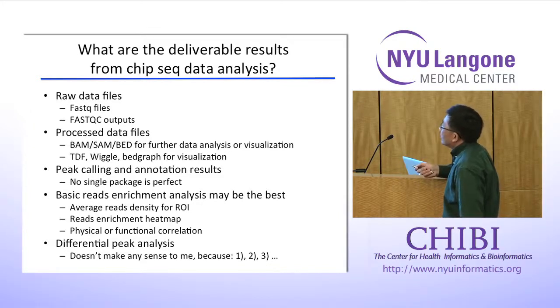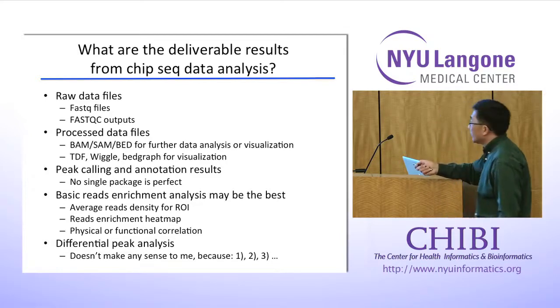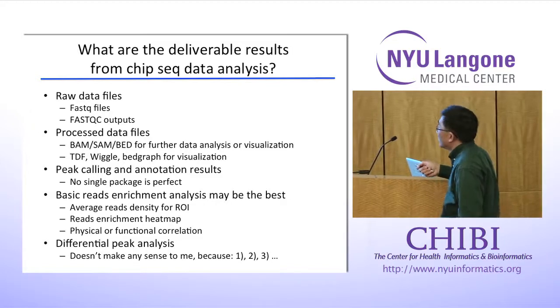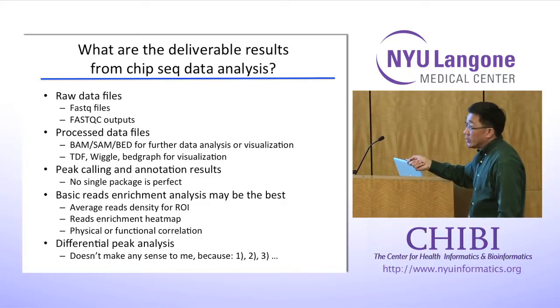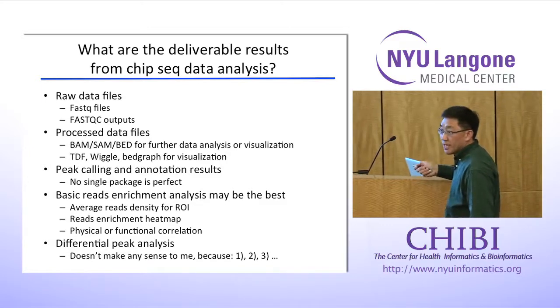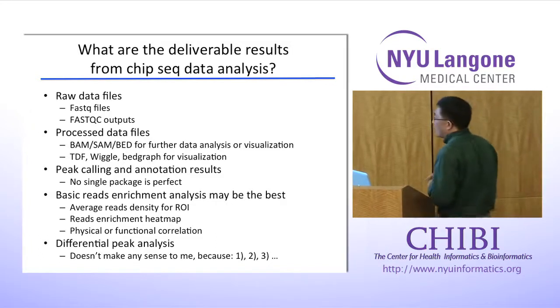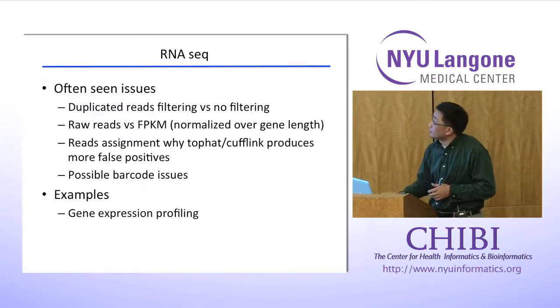And you will get peak calling and annotation results. And for these nice pictures you will have, you can use them for your publication, grant application, and so on, for your thesis if you want. But one thing you don't really expect to get from me is differential peak calling, because I believe there are huge variations. You can't really trust that result, unless you do further verification if you want.